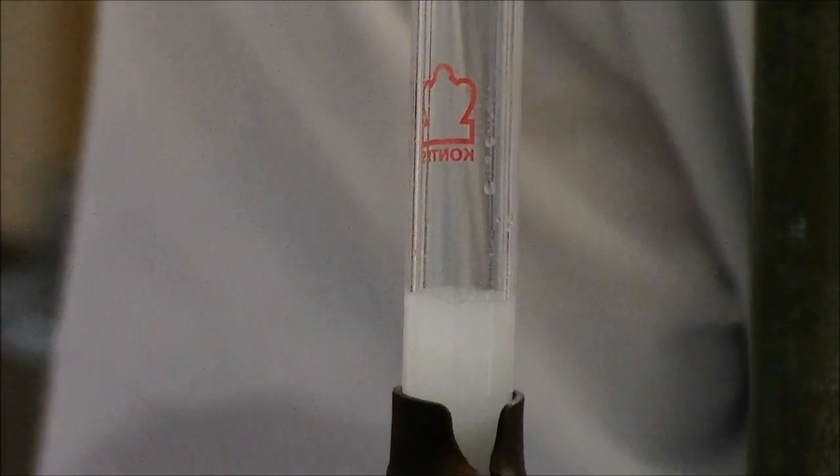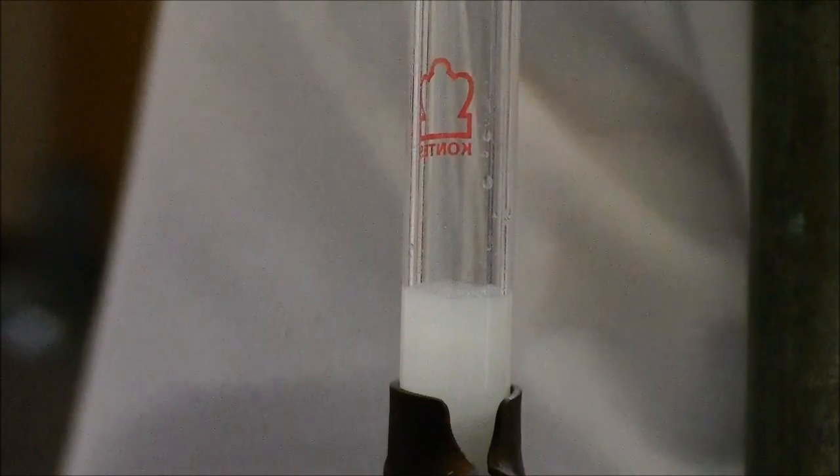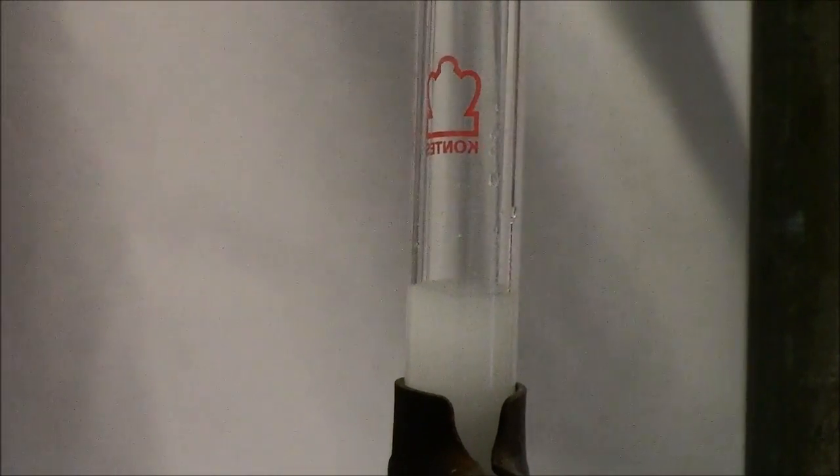Gently add solvent on top. Yeah, like spray it kind of slowly around the edges. Yeah, just a few drops is all we need. Get the tip of the pipette down low. Yeah, okay. So add your drops. Add a few more drops there now, Reese. Just a couple.